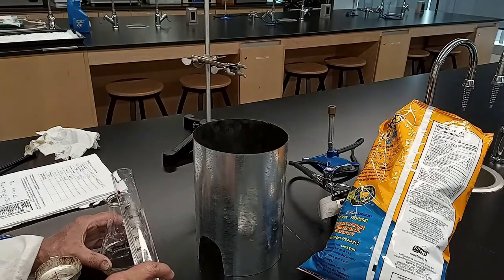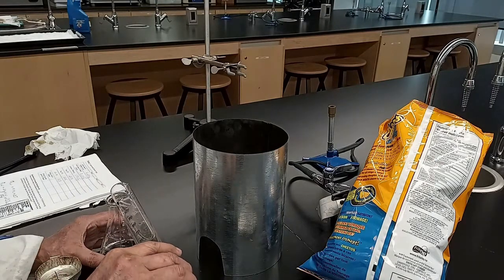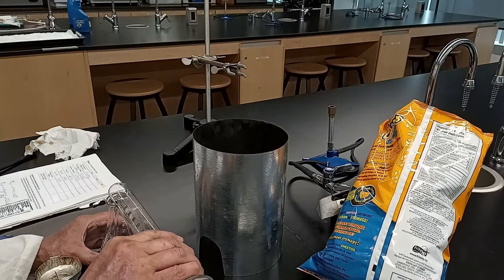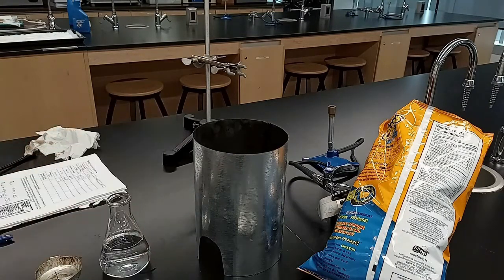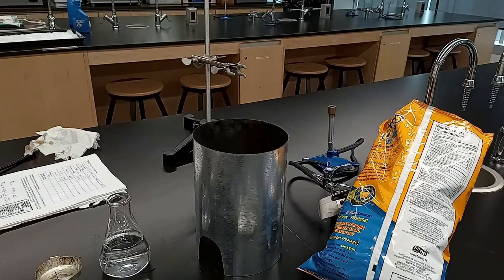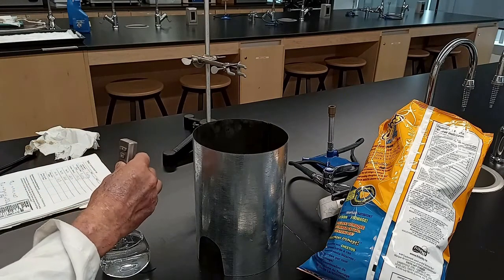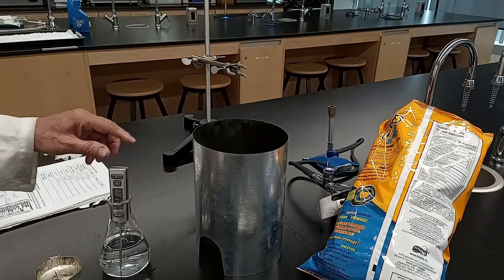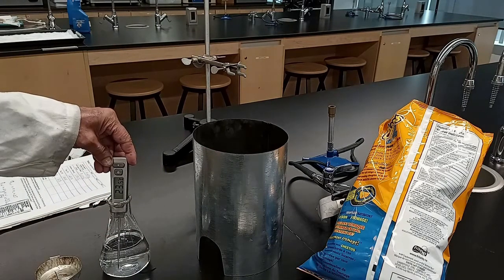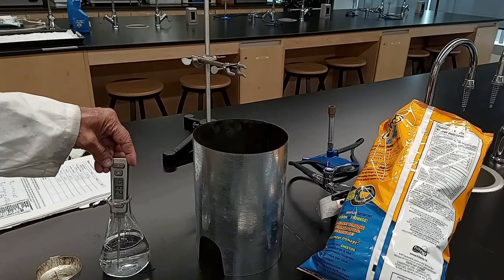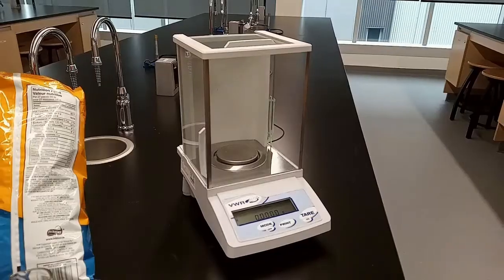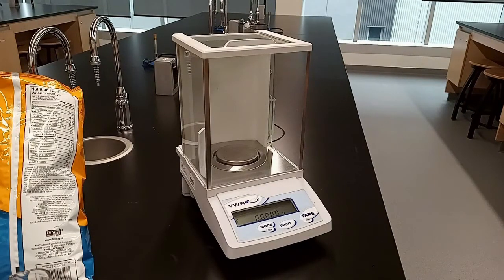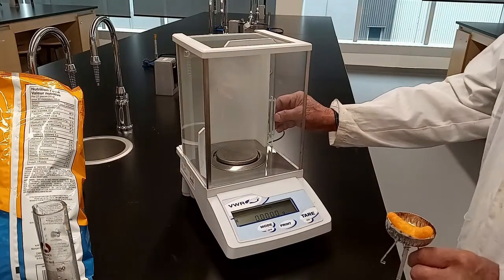Add the second 100 ml of distilled water to the earlier 100 ml already added in the Erlenmeyer flask. Turn the thermometer on and note down the initial temperature of the distilled water. Take the mass of the Cheetos with stand and catch basin.